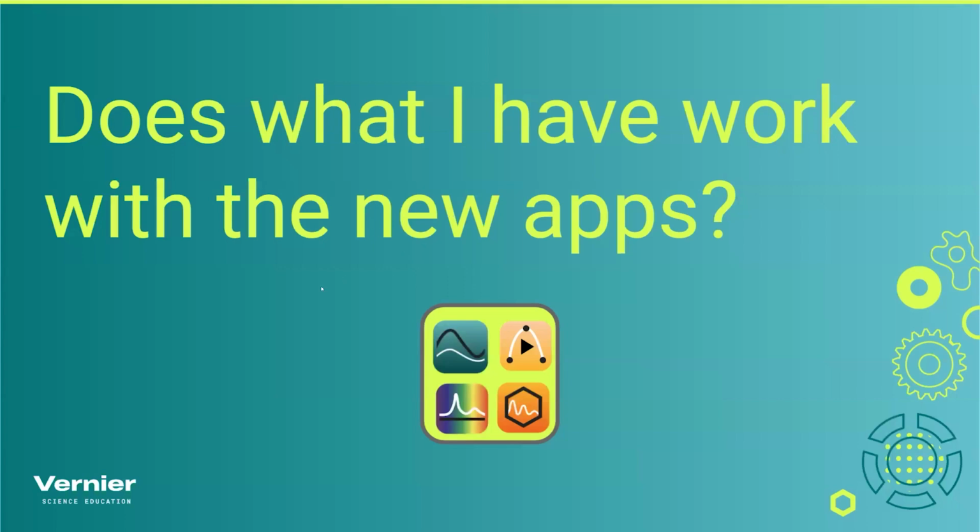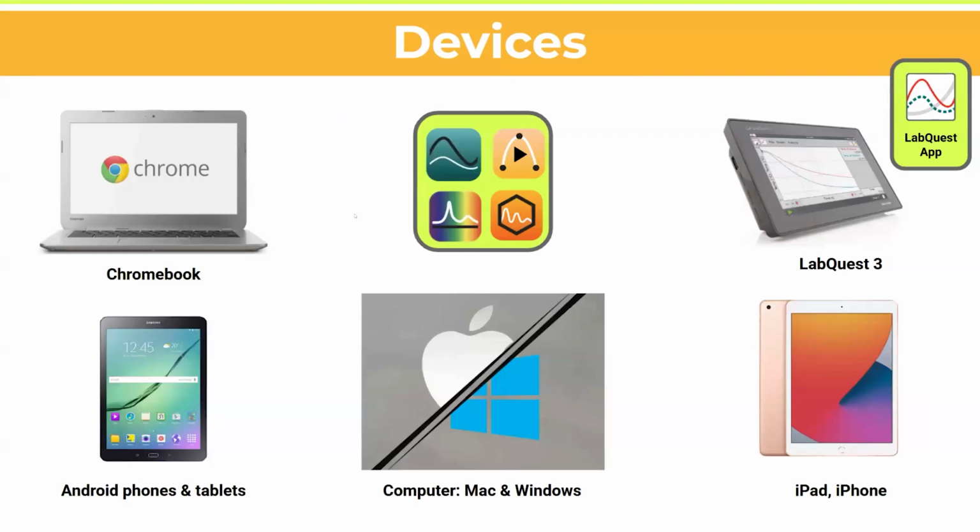So the question then is, what devices work with the newer applications? Very fair question. Let's talk about the devices. Logger Pro basically was computers only, Mac and Windows. So that's the area in which you lived. The good news is that these 4 apps support Chromebooks, which are very popular in K-12 education, less so in college because you can control what the students buy, but we do get college students that say, my instructor told me to get Logger Pro and I can't find one for Chromebooks. Well, that's because it doesn't exist. So they would definitely have to use these applications already. They maybe have a phone or a tablet that they want to use these with as well.